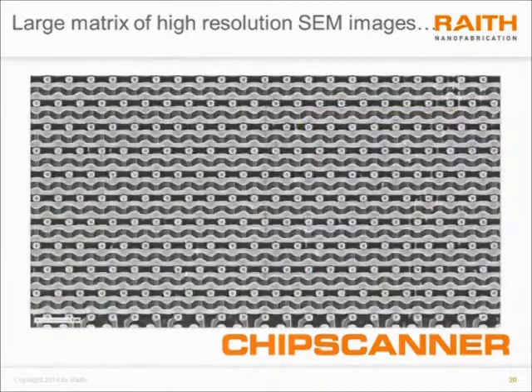let's take a look at this section over here, and we remove the green annotations, and here you can see actually a stitching boundary. But the stitching boundary is not some error in X or Y. This stitching boundary is actually a variation in signal intensity, which is another dimension of stitching errors that I'll come back to a little bit later. But here you can see really X and Y stitching is almost perfect.